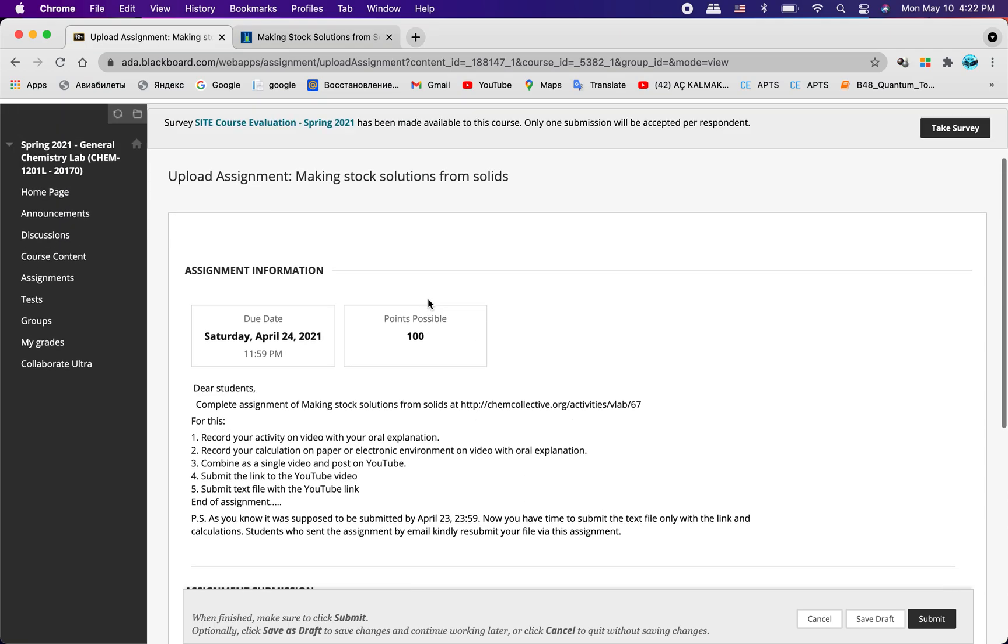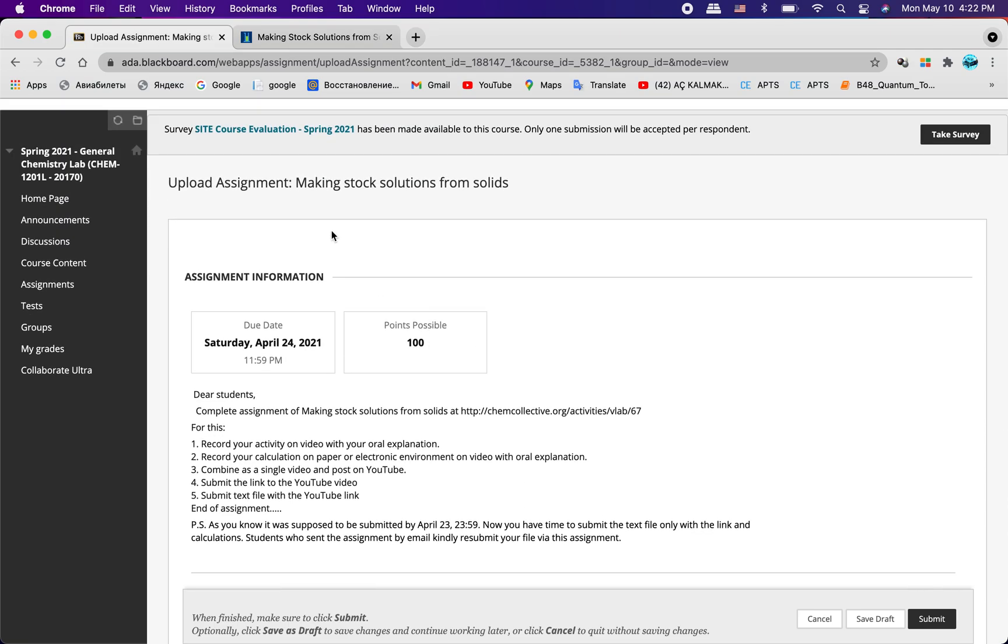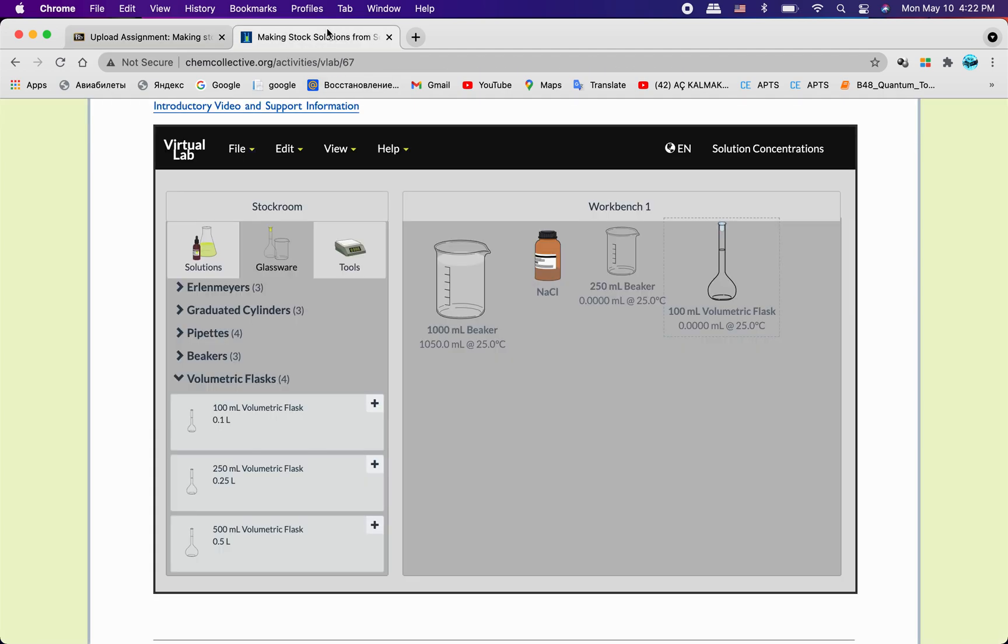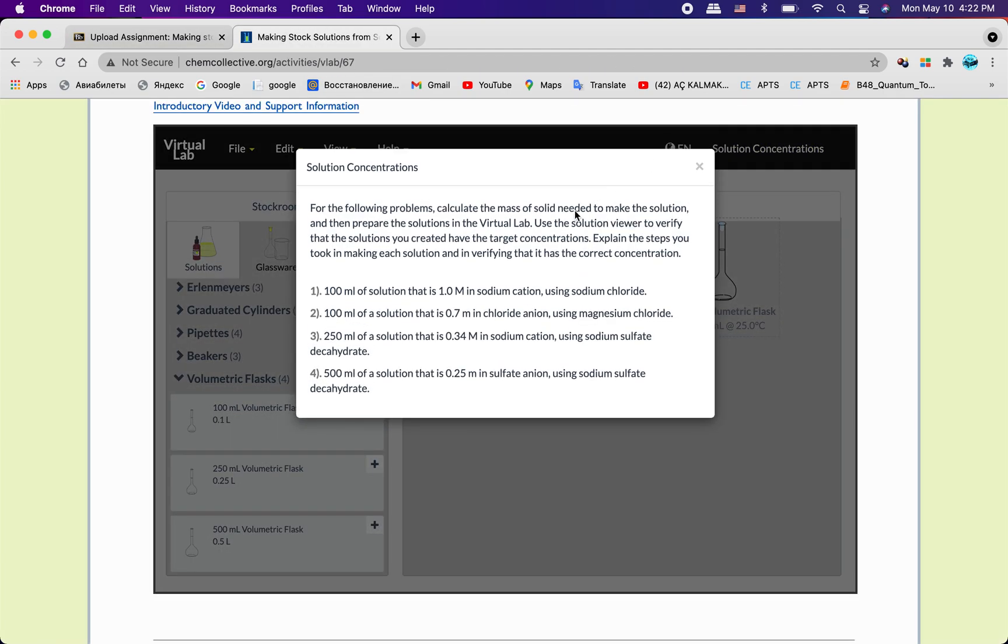Today I will try to explain making stock solutions from solids and let's get started. So our task is for the following problems, calculate the mass of solid needed to make the solution, and then prepare the solution in virtual lab and explain steps you took making its solution and preparing it that has correct concentrations.